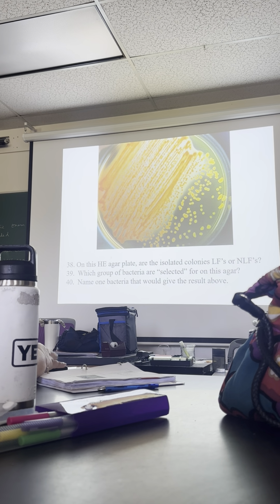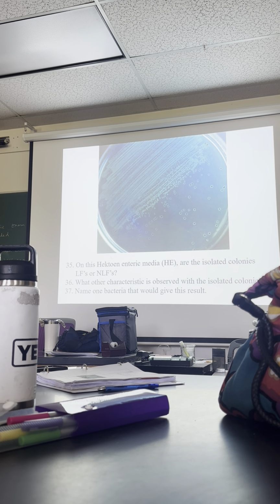Alright, so this is Hektoen enteric agar, right? What's the pH indicator in Hektoen enteric agar? Bromothymol blue. What is the principal substrate? Lactose, very good. So there is also a presence-absence indicator in here. What is the presence-absence indicator for hydrogen sulfide? Iron, very good.